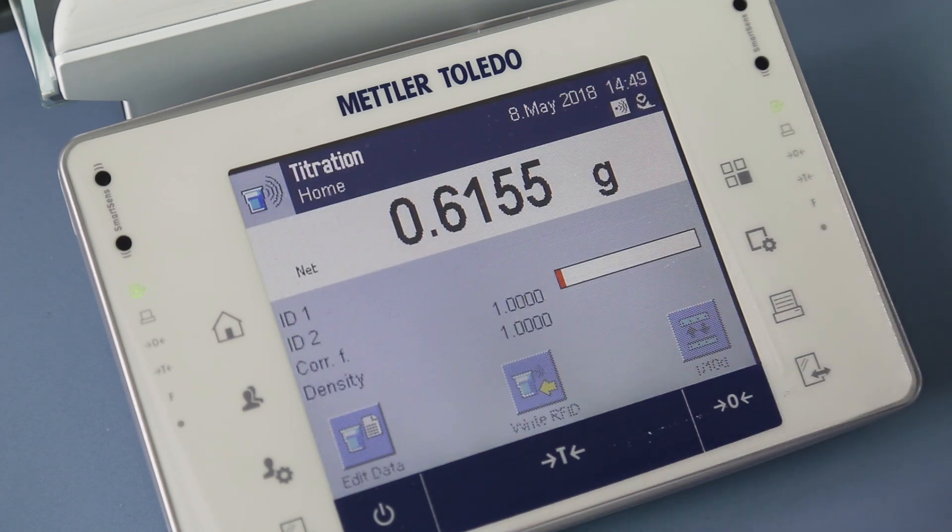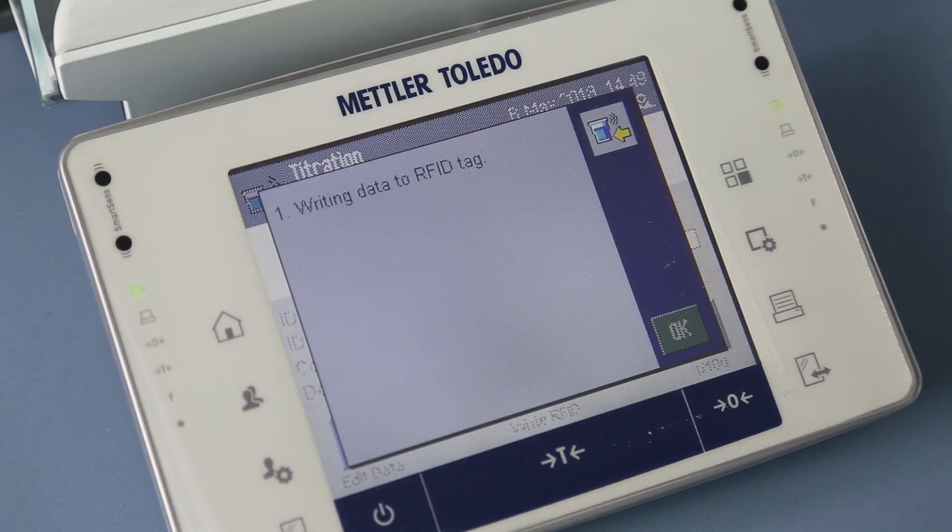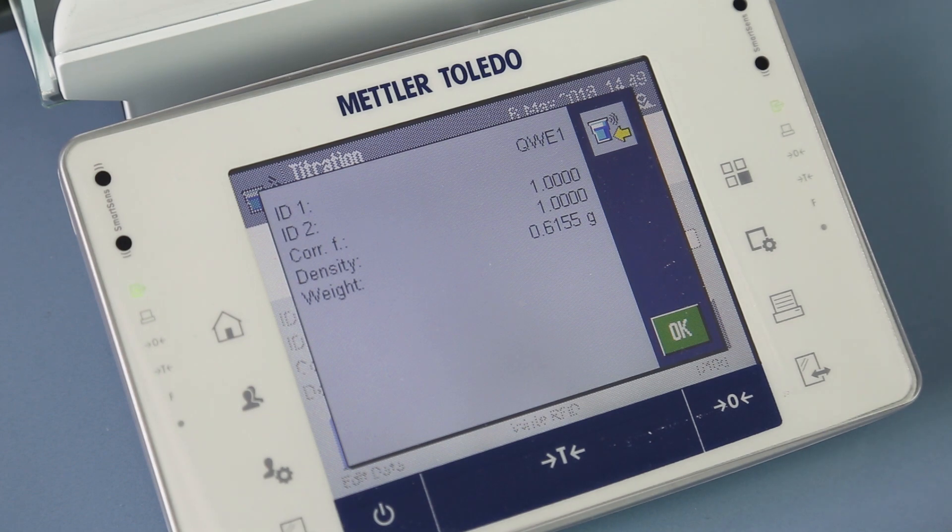The same titration beaker is used, with a disposable RFID tag underneath, which can be read and written to on the balance, including sample IDs.